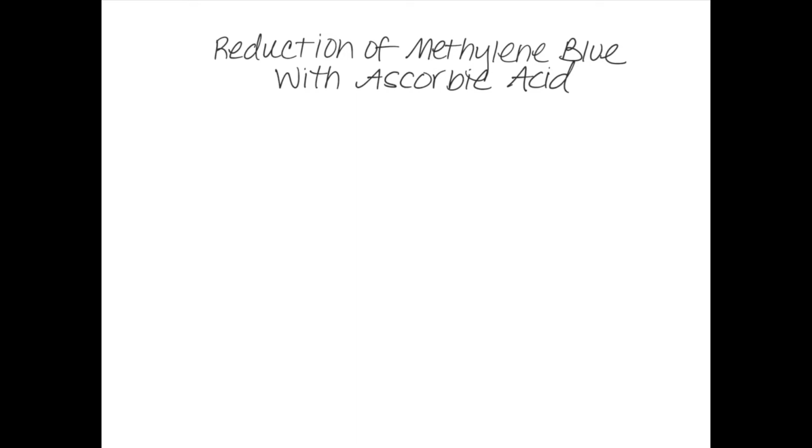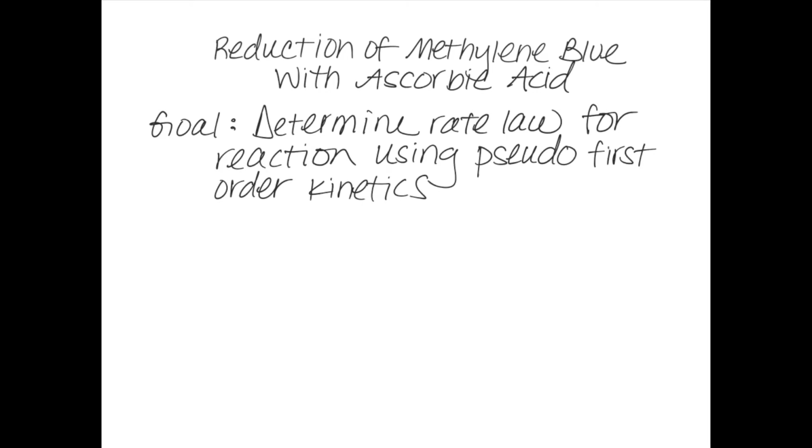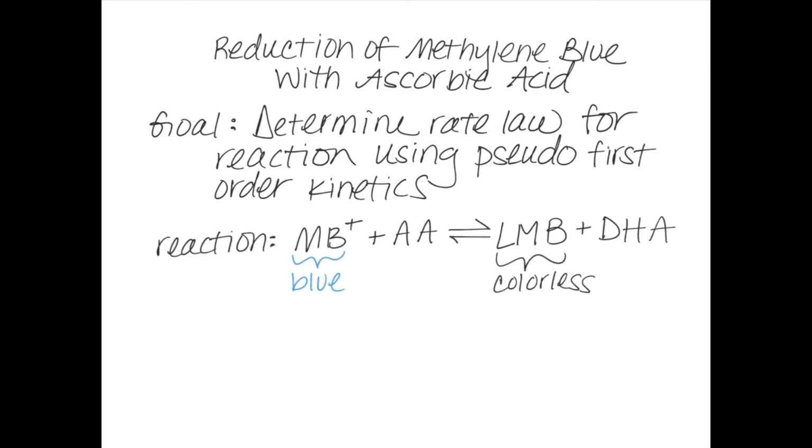Welcome to the reduction of methylene blue with ascorbic acid lab. The goal for this lab is to determine the rate law for the reaction using pseudo-first order kinetics. This is the reaction that is occurring. Methylene blue, which is a blue color, is reacting with ascorbic acid. Ascorbic acid is reducing methylene blue to become leucomethylene blue and dehydroascorbic acid.